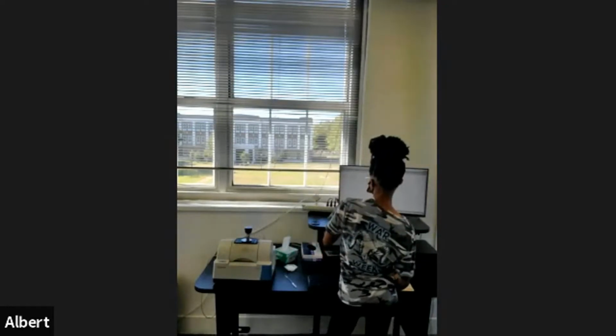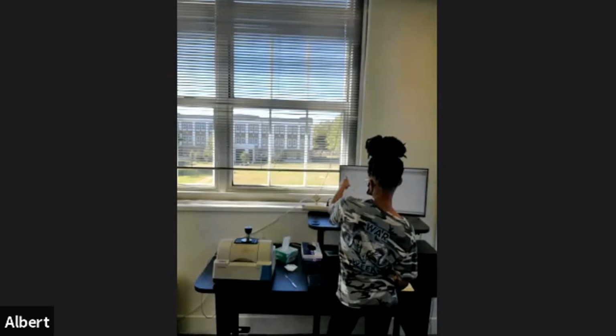Okay, you need to rotate the arm and then make sure that the press goes the other way. Then it's going to keep going until you hear that click. Okay. So this is sample number 2. We don't need to run it. Just run it back around. You can just go ahead and collect sample. Select the sample. Yes, you need to run it out. You can just collect sample.